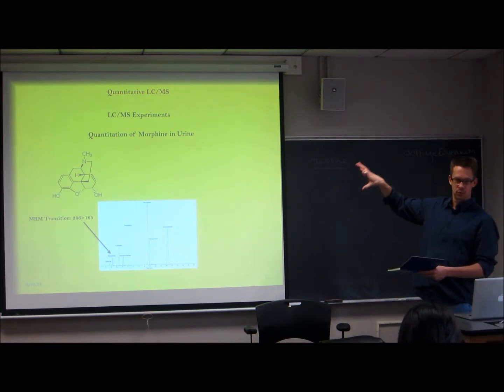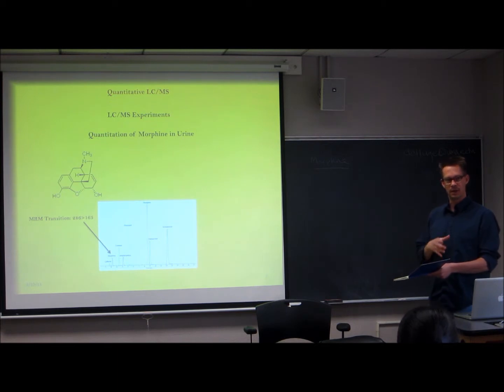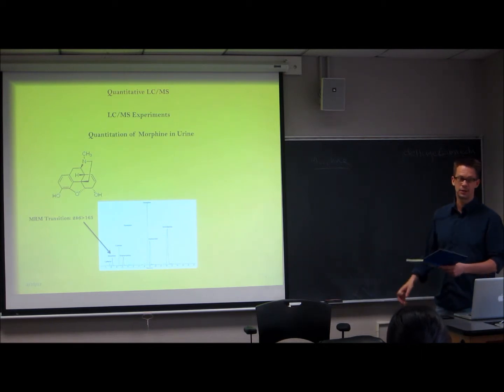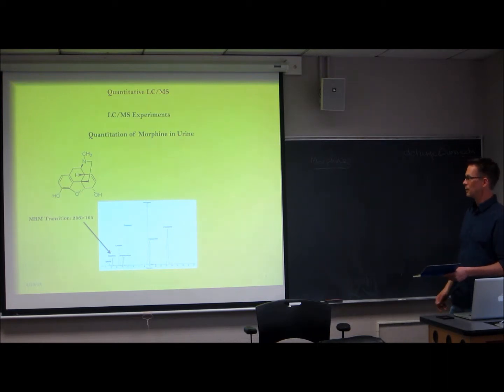After we talk about this, we'll talk specifically why it's a good idea to use a matrix for your standards that's similar to the matrix you're doing quantitation. Sometimes it can't be done, and if it can't be done, there's things we can do, and we'll talk about that too. If you're doing external calibration, it's an absolute must, without an internal standard present, that you make up your standards in the same matrix you're quantifying.